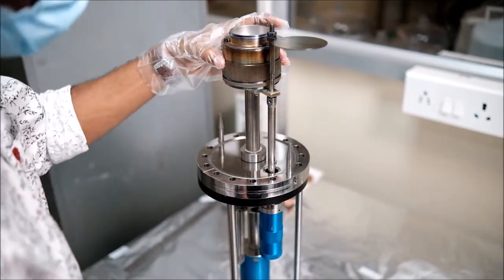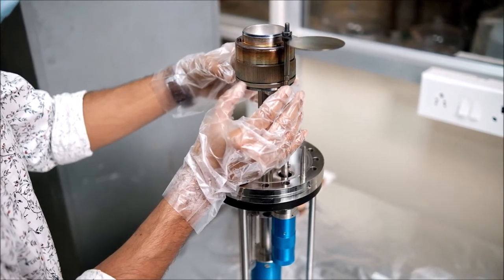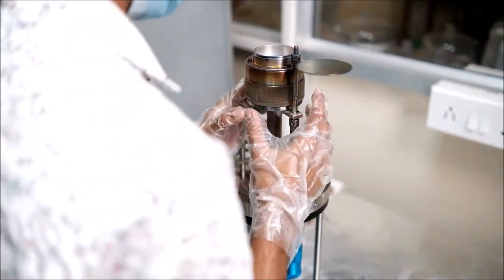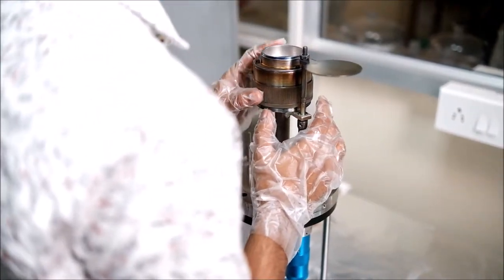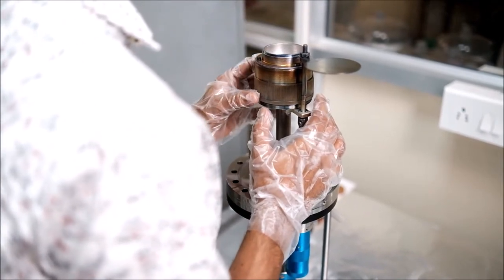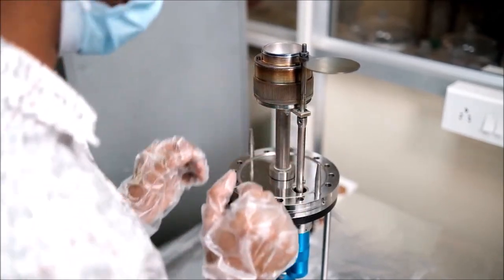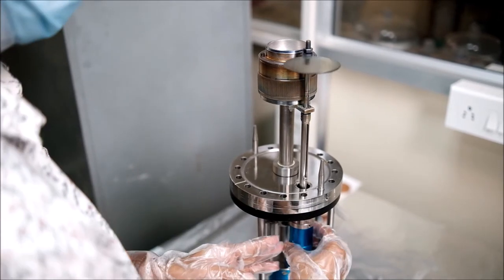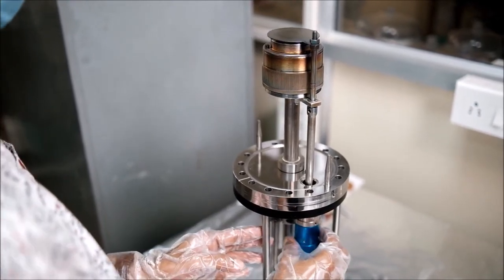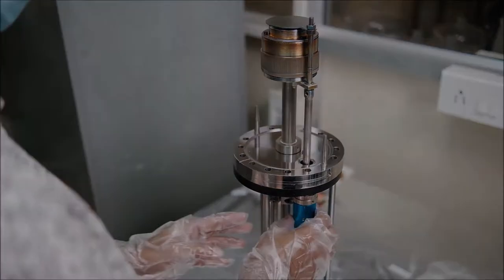It is recommended to keep a 2 mm distance from the target to this funnel part. We first make a contact connection, then make a half rotation in the opposite direction so that there is a 2 mm distance from the target to the funnel. With the help of this ring we lock it. Now argon ions will only see the target from the top and only our target material will get sputtered. Through this shutter we control when we want to deposit onto our substrate.